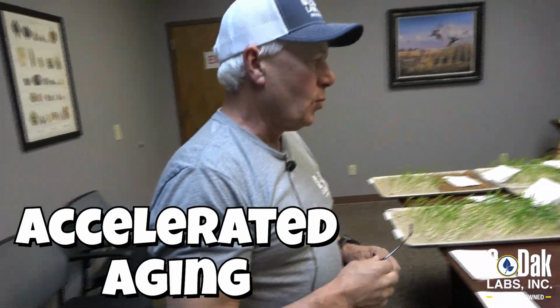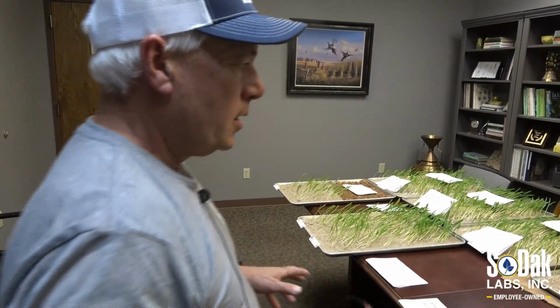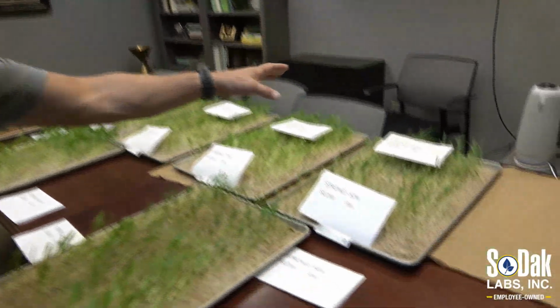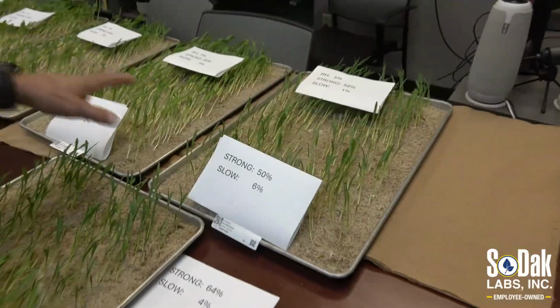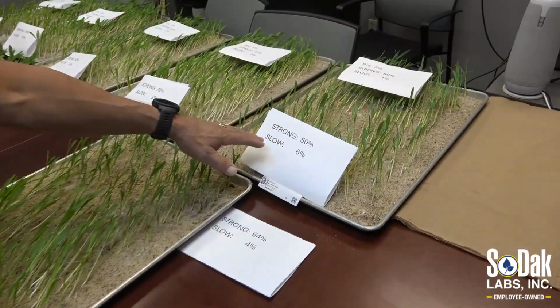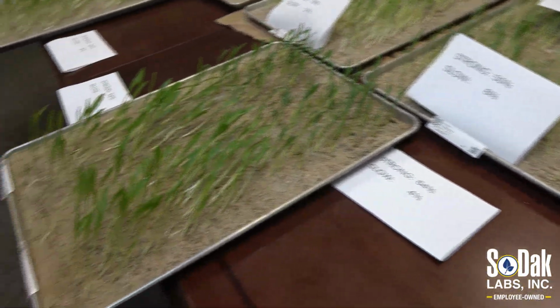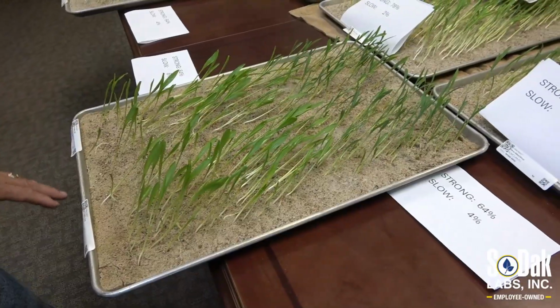All right, so now we've brought in a third test here. It's the accelerated aging on sweet corn. So we kept our sand germs, so the scores in the back are the sand germs. We left the 50 Fahrenheit cold test score here on the front, just for reference, and then we want to look at the accelerated aging.